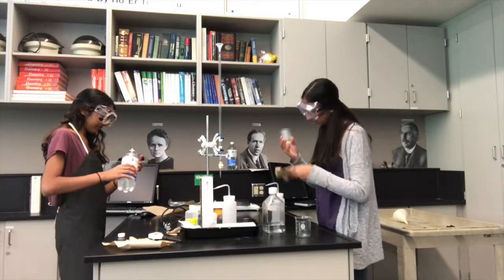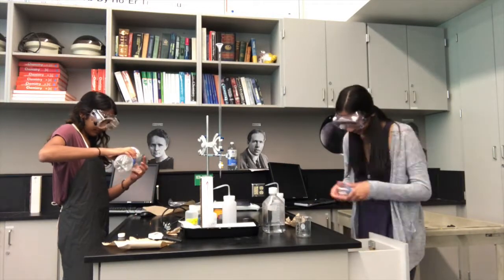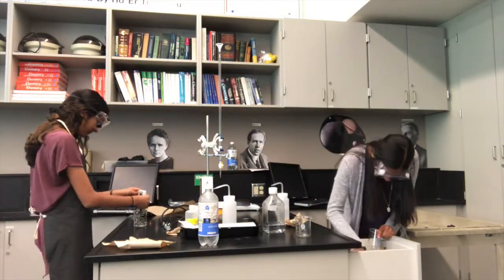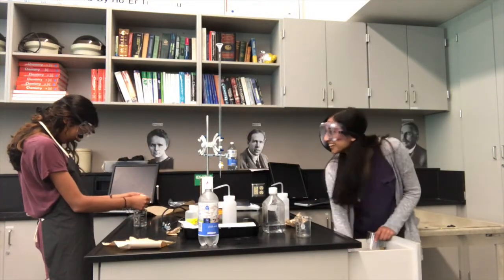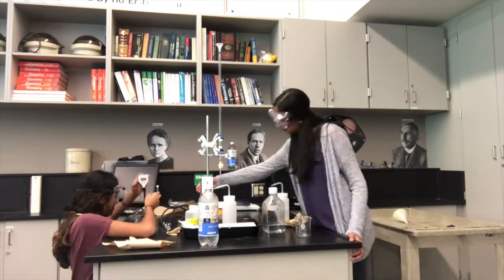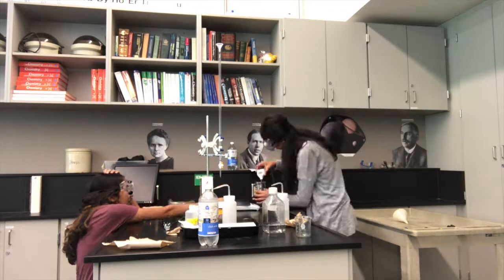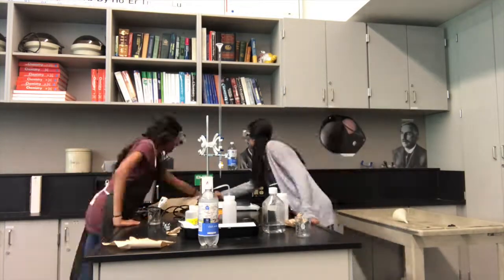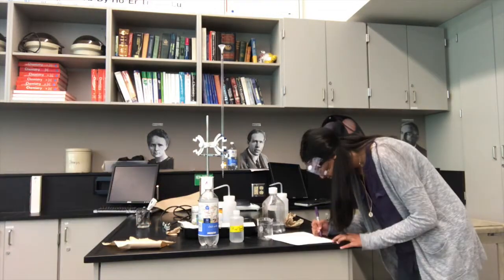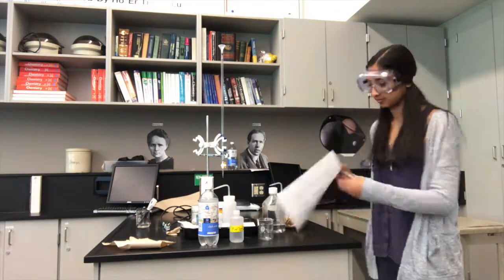Measure out 25 ml of carbonic acid in a beaker. Then record the pH of the carbonic acid to make sure it's actually acidic. Record the pH for future reference.